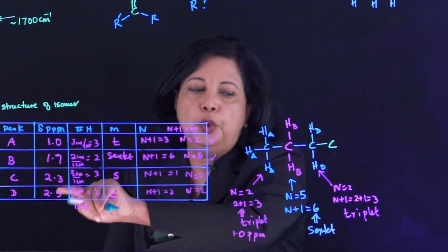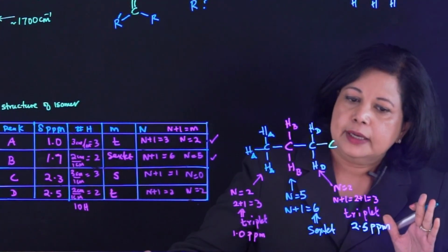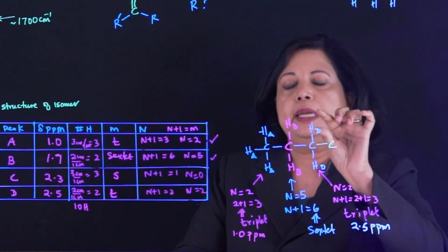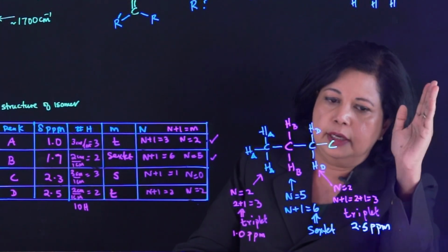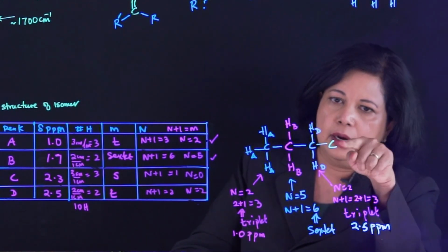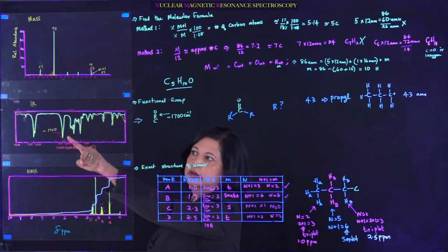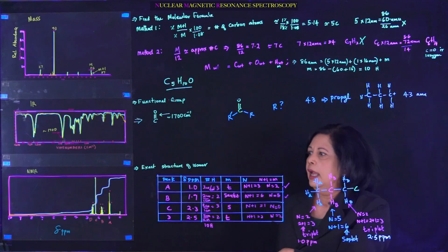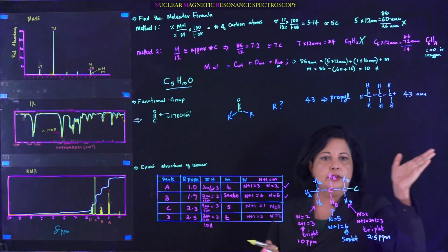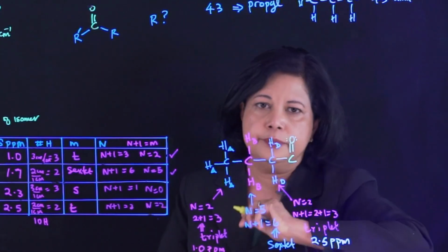But this one is at 2.5 ppm. So what can you conclude about that? We can see because it's in a de-shielded environment, there must be a group here that's electron withdrawing. And if you look at your chart, 2 to 3 could be a benzene or a carbonyl or a triple bond. Well, what do we see here? Carbonyl. And we don't have anything in the 7 to 8 region. And so therefore, let's assume right now that that is what you have over here, a carbonyl.